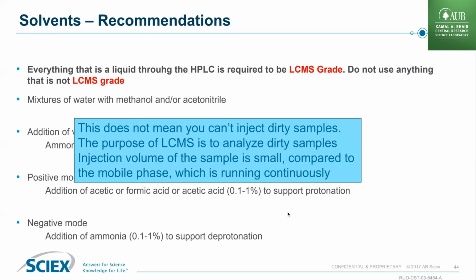Of course, the purpose of the LCMS is to analyze dirty samples. Your sample will be injected onto the LC in a very small volume, maybe 5 microliters or maximum 10 microliters. And the purpose of the chromatography system is to separate your compounds from the matrix, which is the dirt, the salt, and everything else in your sample.